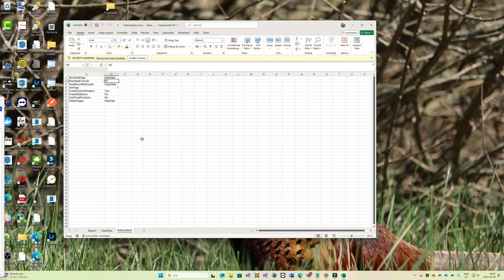So actually, when you export, the first thing Picsara does is to look at the third page. It can be named anything, but it looks in the third page, so the file must include 3 pages. And in B1, it will look for where to put the data, so on the raw data page, and then where to put the first cell on the raw data page.